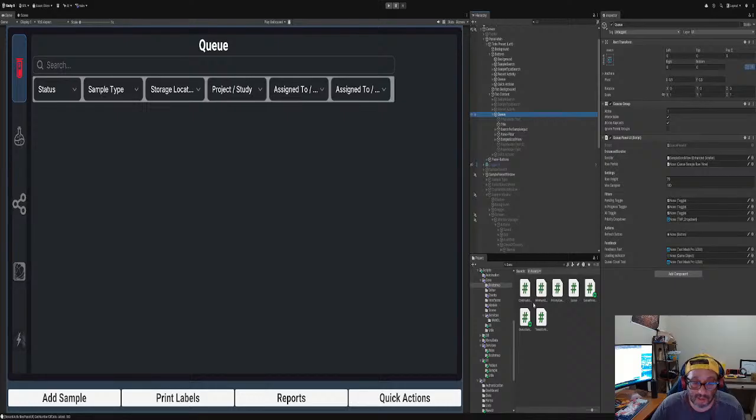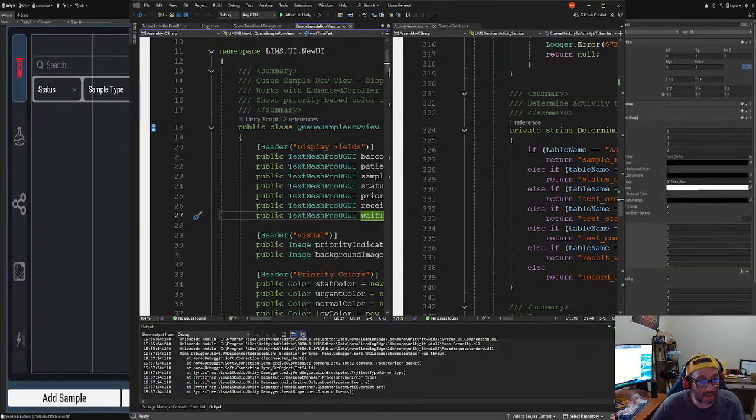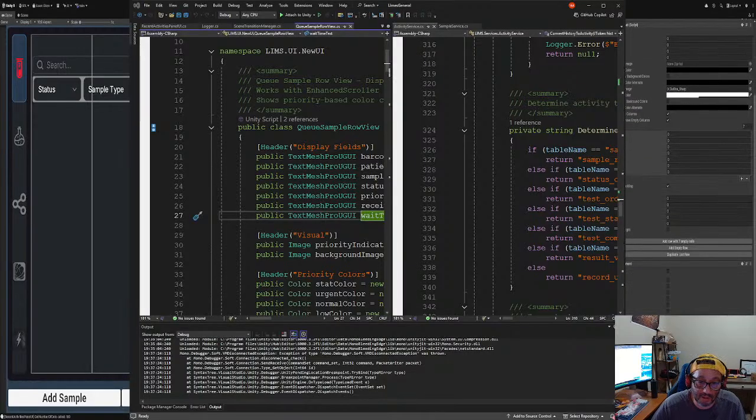So we go down here, and we're just gonna right click on anywhere. Doesn't matter. Table layout. Add new table. How many did we need again? 1, 2, 3, 4, 5, 6, 7. So one row with 7 columns. Right? Again, very easy to do. Then we want the table layout width. It's a flexible width, but we want the height just to be 50.